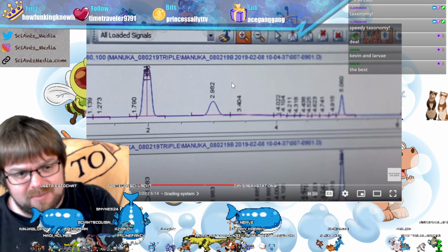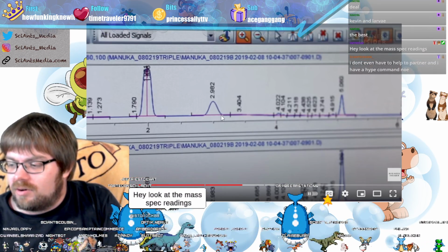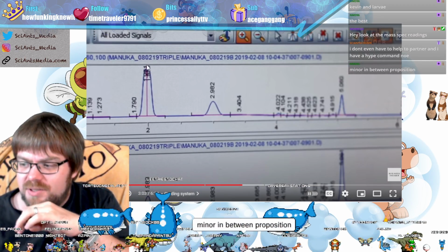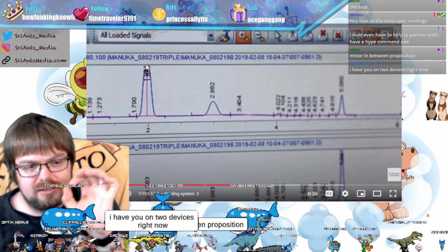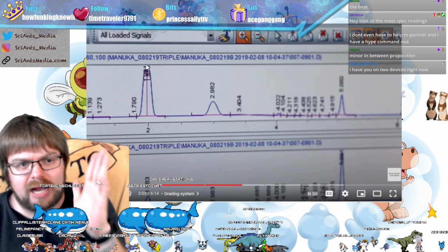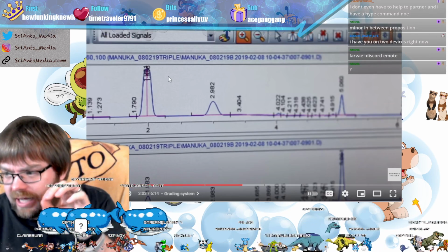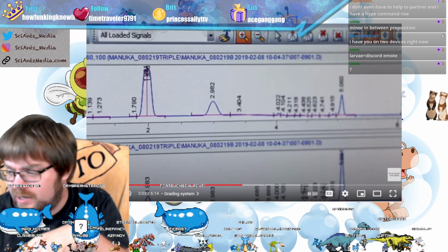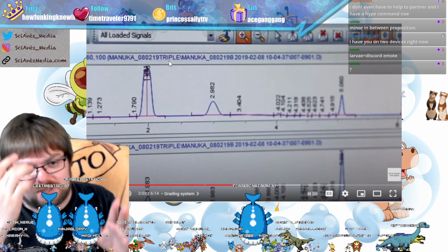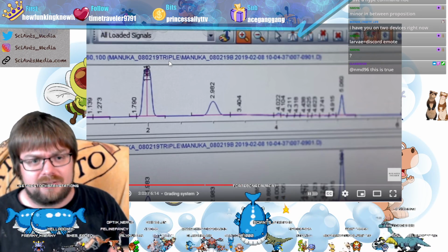So this is the mass spectrometer data. Yeah, look, mass spec readings. So when you're actually pulling out this data, there's software to actually dissect what these spectra mean. So a researcher won't look at these peaks and be like, okay, this peak is clearly this kind of thing. No, there's software to dissect it. So you can actually click on it, and like, I can't demo it on the video, but if you click on this particular region, it'll show you what molecules are comprised in that little spectra.